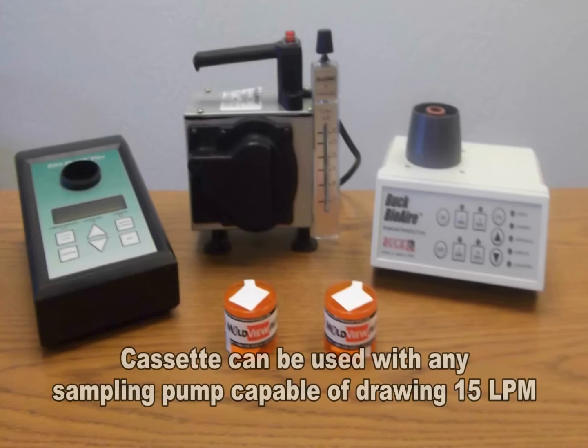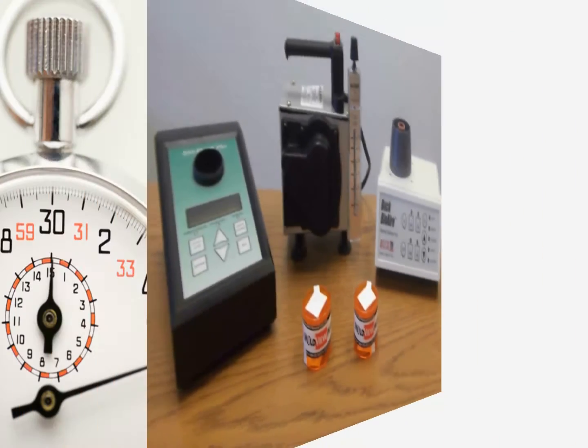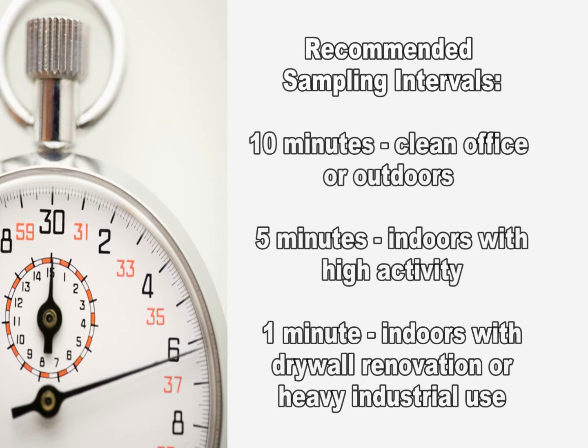The cassette can be used with any sampling pump that is capable of drawing 15 liters per minute. Sampling times range from 1 to 10 minutes based on environmental conditions of the sampling environment.